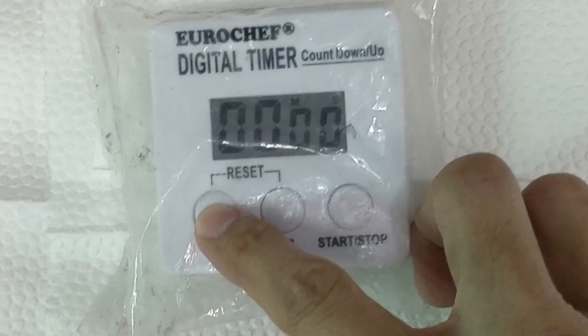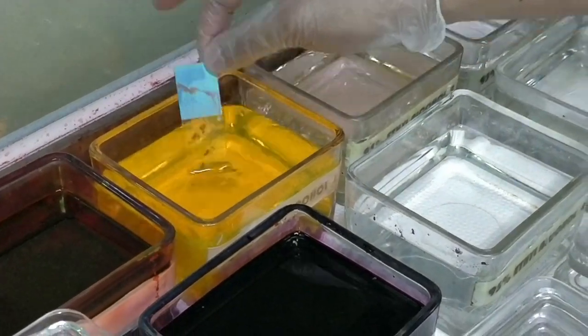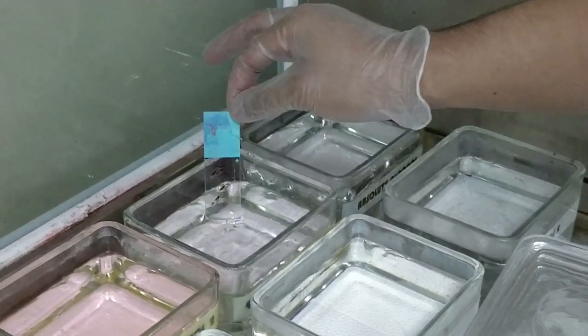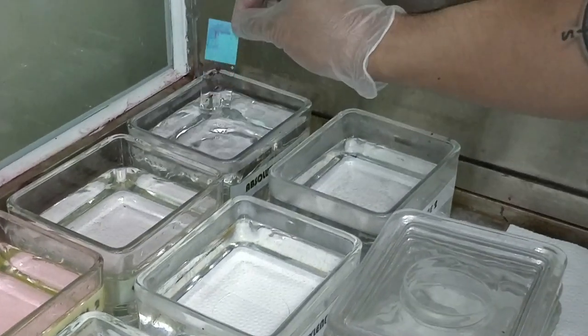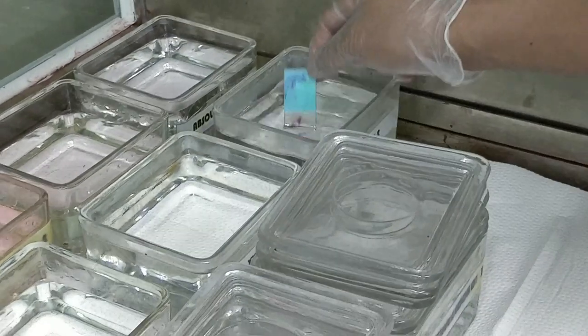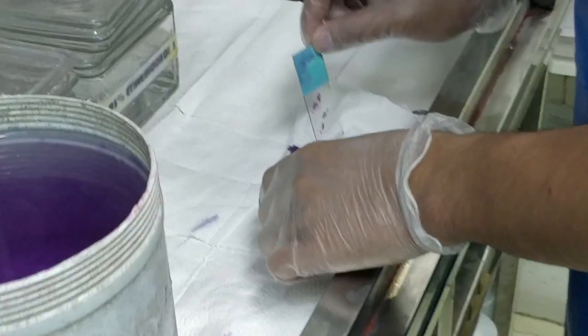Hematoxylin is a basic stain in a sense that it stains the nucleus. So the staining technique will be, of course, covered in the staining chapter. But simply put, you just stain hematoxylin for the nucleus and eosin for the cytoplasmic organelles, no? And all these other chemicals are just there to enhance or clear what should be stained, and what should not be stained. So, we add it.